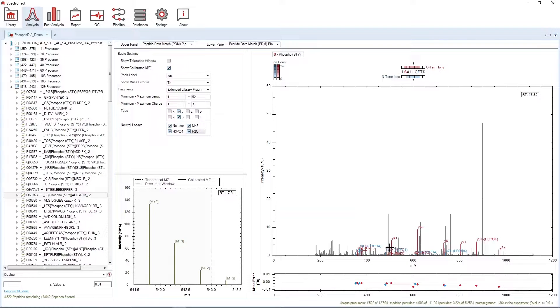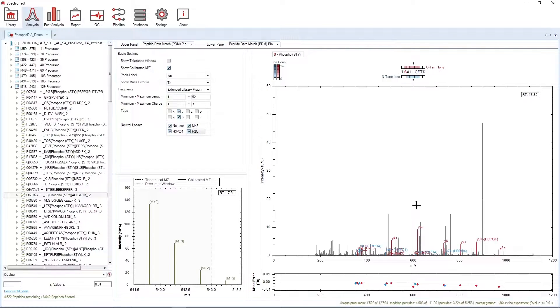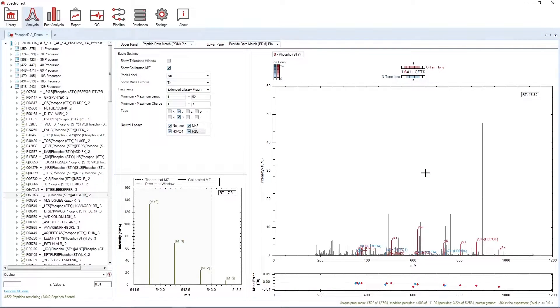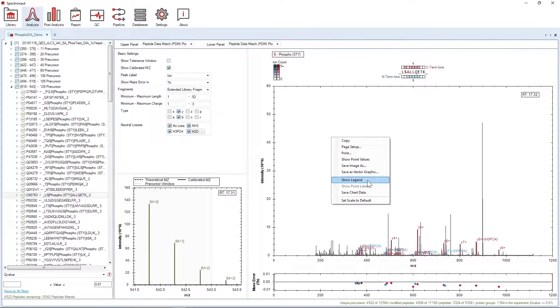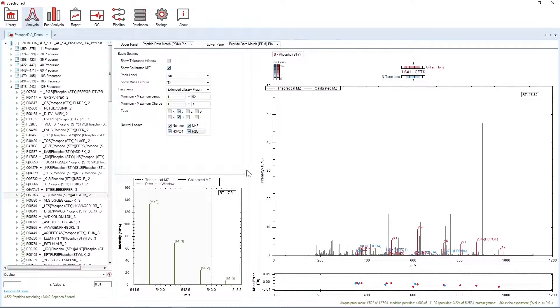The fragments in the spectrum as well as the mass error data points and the Sequence Coverage panel have two colors. Blue for N-terminal ions and red for C-terminal ions. Here too, I click on Show Legend.